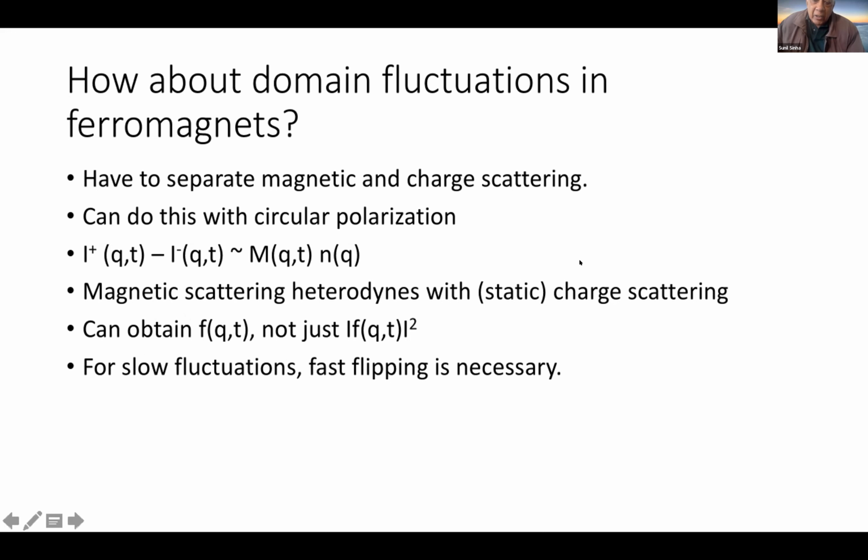The other thing I learned doing experiments at APS: we did some experiments with Suresh on gold nanoparticles moving in lipid multilayers. They move in the plane, and they move quite fast, almost ballistically, or at least fast diffusion. To measure these fast in-plane motions, you need to measure down to very small times.